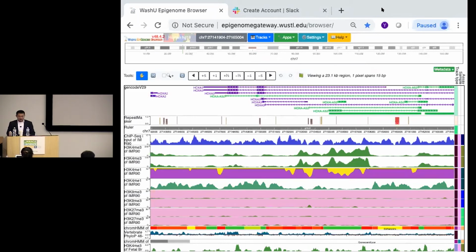Which means I'm going to do my manipulation over here, but you can see it. You open on a browser, you can see it. Now I'm in St. Louis, you're in Los Angeles. I'm working on a browser session that I shared with you. You can just sit back and look at all the things I'm doing on the browser. That's a new function that we created, we call live browse.